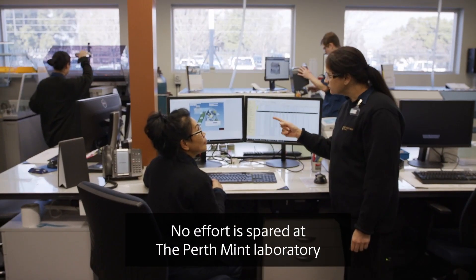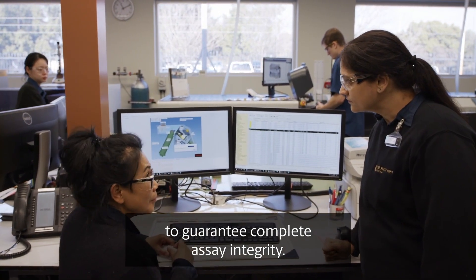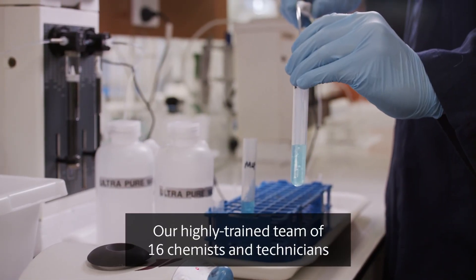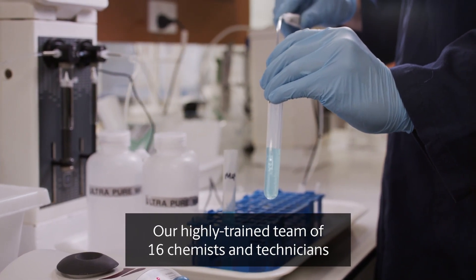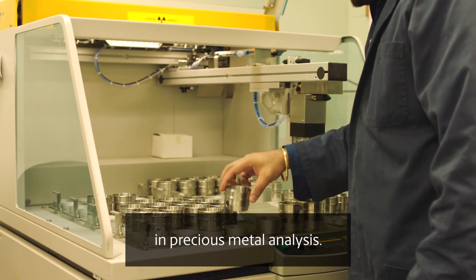No effort is spared at the Perth Mint Laboratory to guarantee complete assay integrity. Our highly trained team of 16 chemists and technicians have more than 200 years combined experience in precious metals analysis.